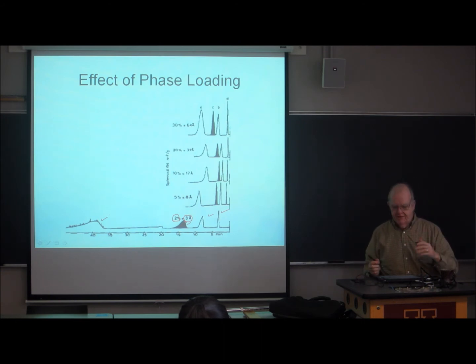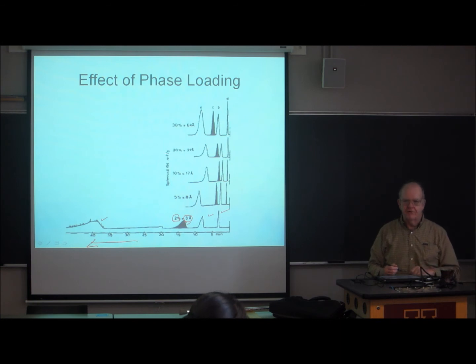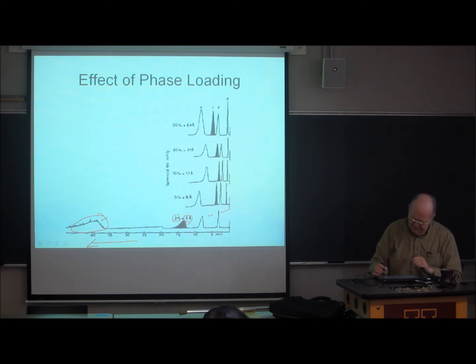And the more retained the solute is, and retention time is increasing in that direction, the more retained it is, the slower the desorption rate is, and you get some really horrid looking peaks. Now, as you load on more stationary phase, you do a better and better and better job of coating. This is now an 8 angstrom film, and you see a huge improvement by going from 2 angstroms, or from 3 angstroms to 8 angstroms. And it gets better, and it gets better.